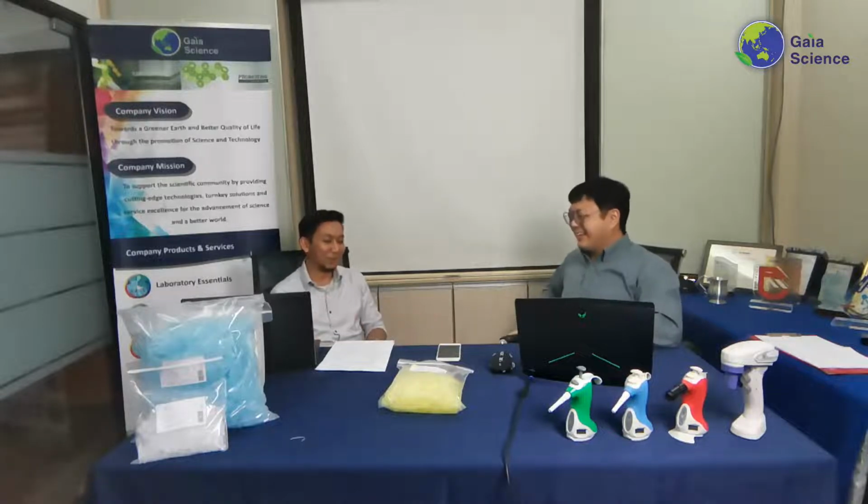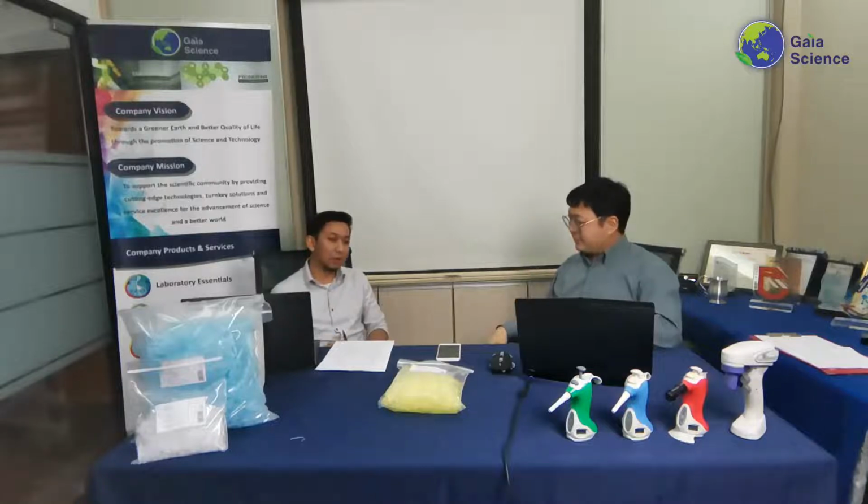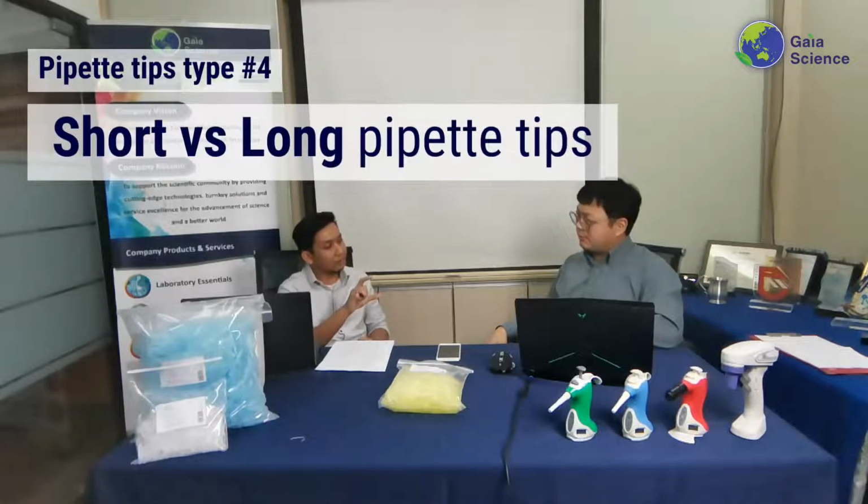I guess we don't want to get things wet, particularly talking about filtered tips. So you also mentioned something more like molecular work research. Yep, it's more common if you're talking about molecular work. If you go to their lab, you notice some of the pipette tips are longer than the normal ones. I guess this is what they call extra long pipette tips. Yes, correct. It could be extra long.